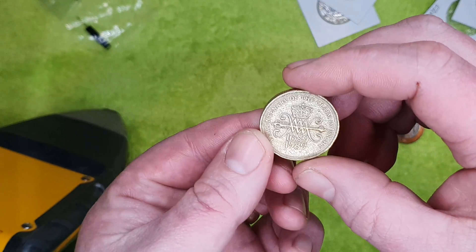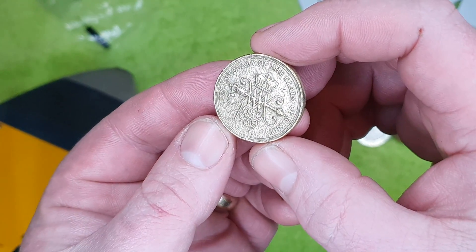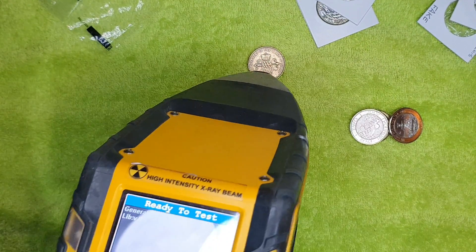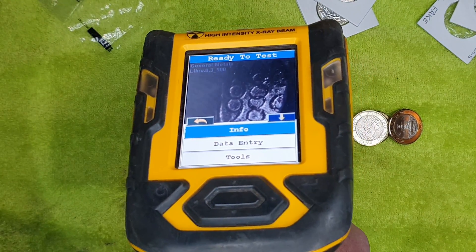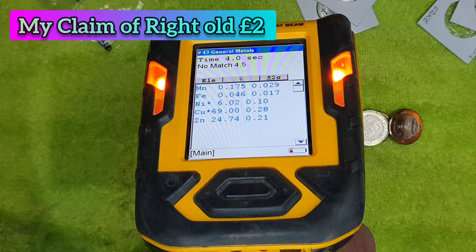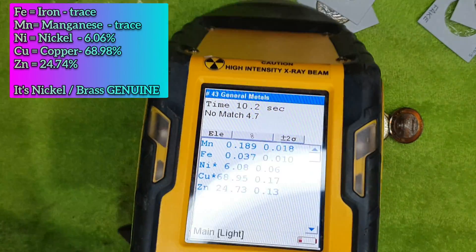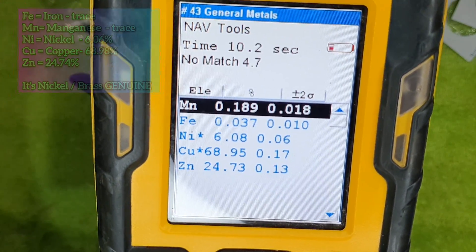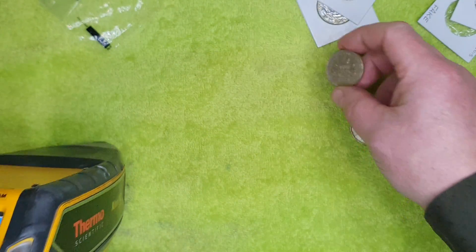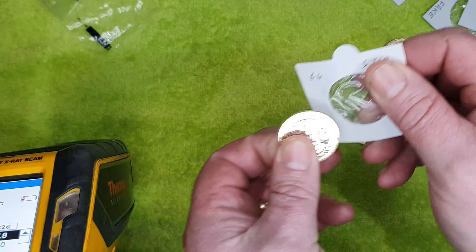We'll give this one a go. I bought this cheap, but it's a Claim of Right, which is one of the rarest two quid coins you can get. It should be nickel brass. It just looks worn. Brass is an alloy of zinc and copper. So that's reading zinc and copper and nickel, with just a few trace elements — manganese and a bit of iron — but nothing much. So that's genuine. I'm happy with that one.